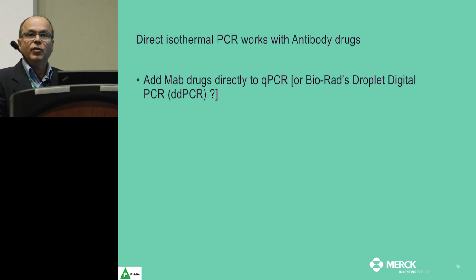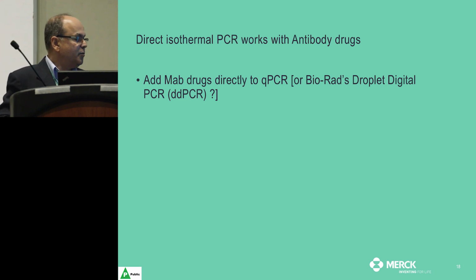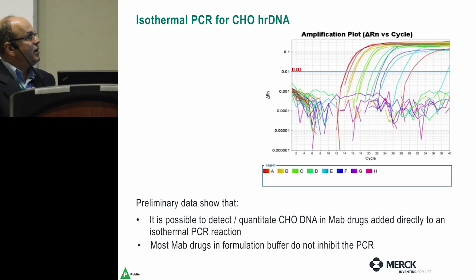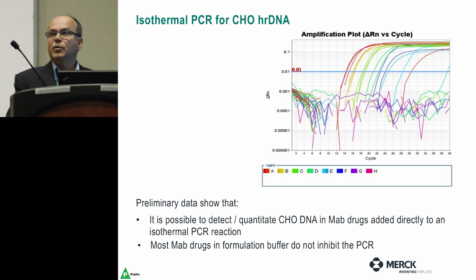Most of what I showed in the previous slides is published. This is not published, and we are in development. And we are doing it in a qPCR setup. Now the question is, will we be able to do it in digital droplet PCR?